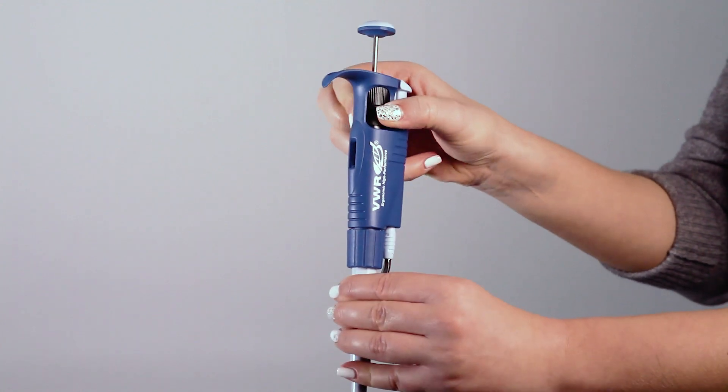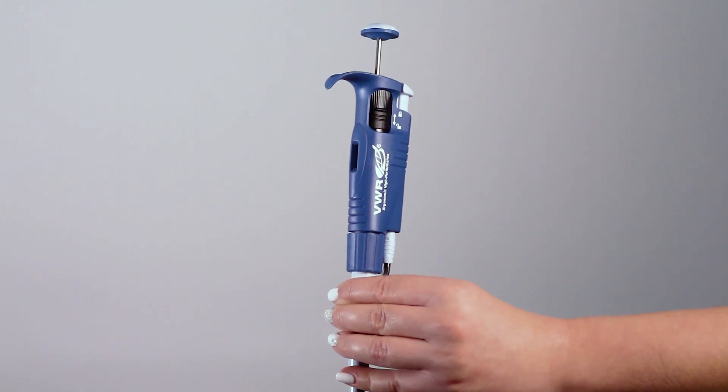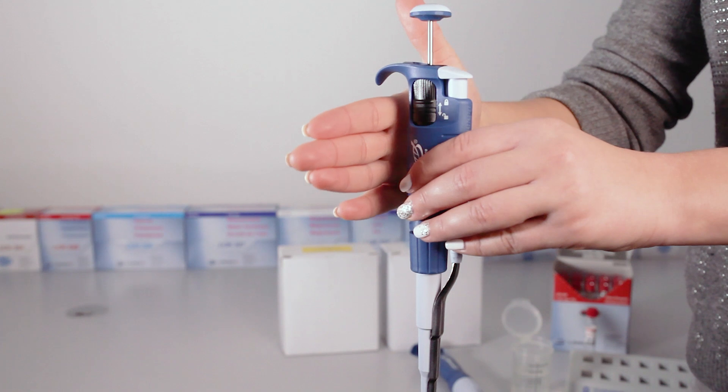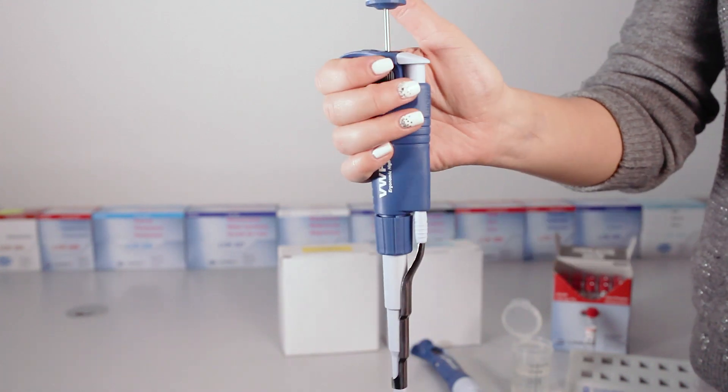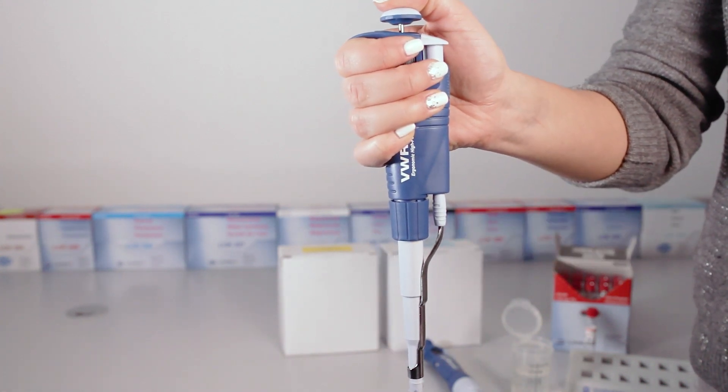For taking a sample, the button should be pressed down until the first pressure point. For releasing the sample, the button should be pressed down until the second pressure point.